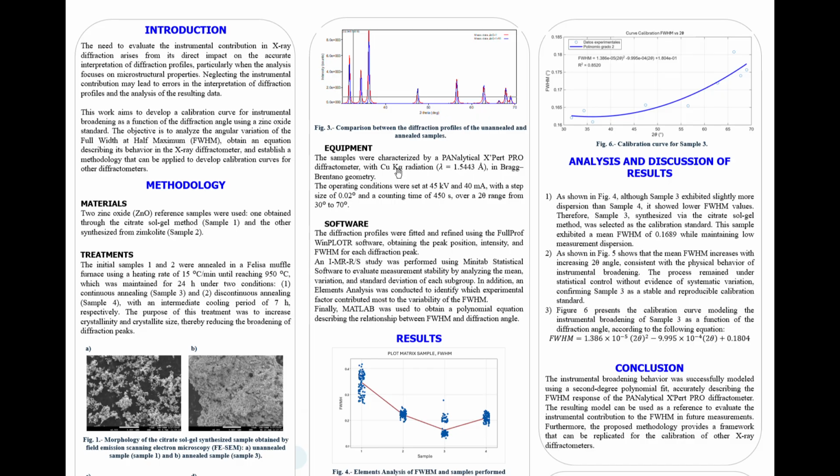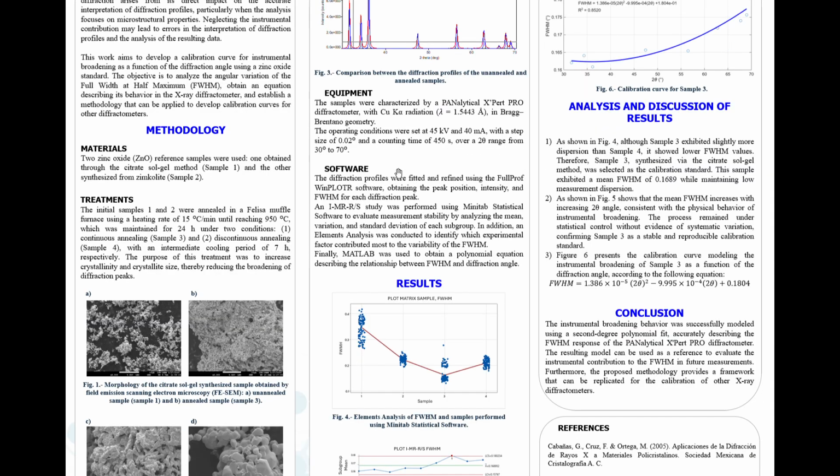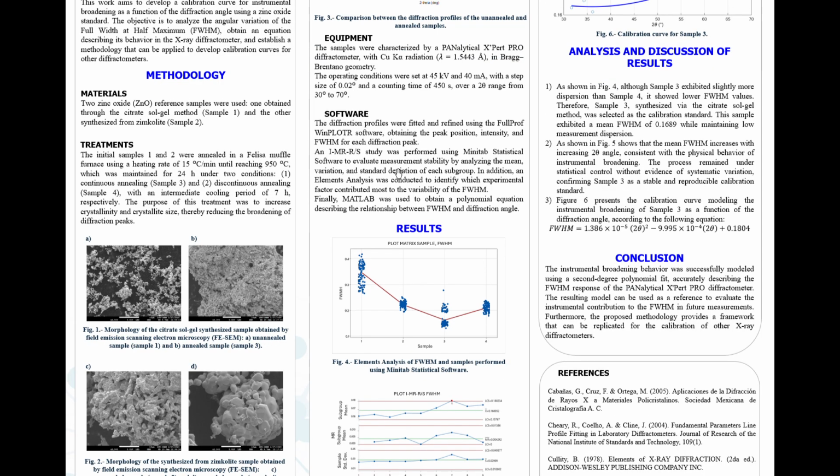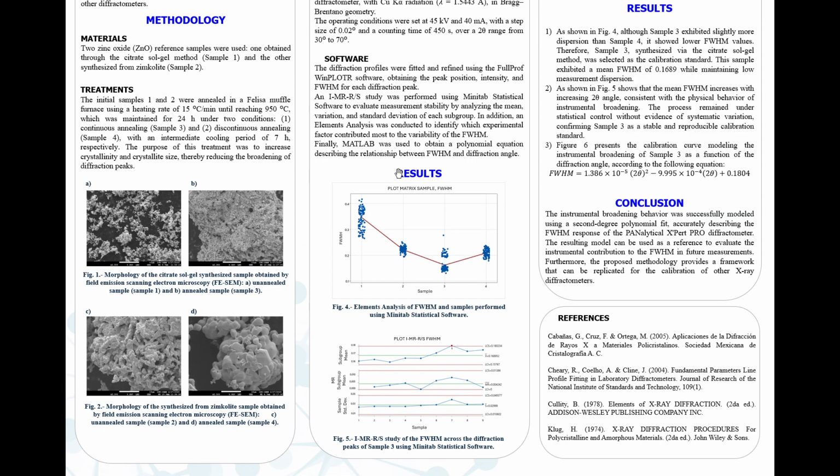And the data obtained were statistically analyzed by comparing the FWHM values among the samples to determine which sample showed the most suitable behavior, considering its variability and FWHM values.